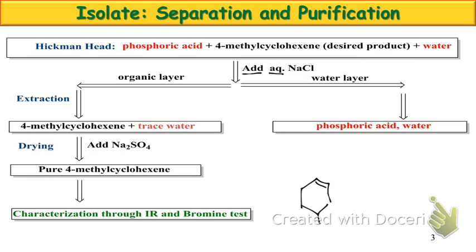Why don't we add, say, an organic substance, say diethyl ether? Like dissolves like, so the diethyl ether will dissolve your organic product. That's fine. You still get two layers. Why do we not add ether? That's the stuff we want. We don't want to mix it. So it adds an extra evaporation step, but diethyl ether has a really low boiling point, right? 35 degrees Celsius. So we could just leave that out. The ether evaporates off. We've got our product. So that's not a huge barrier to that.